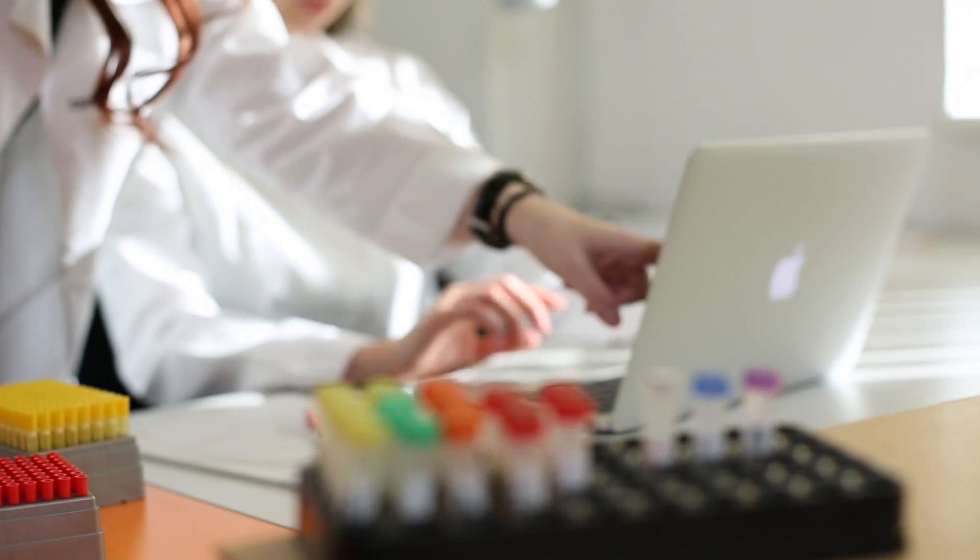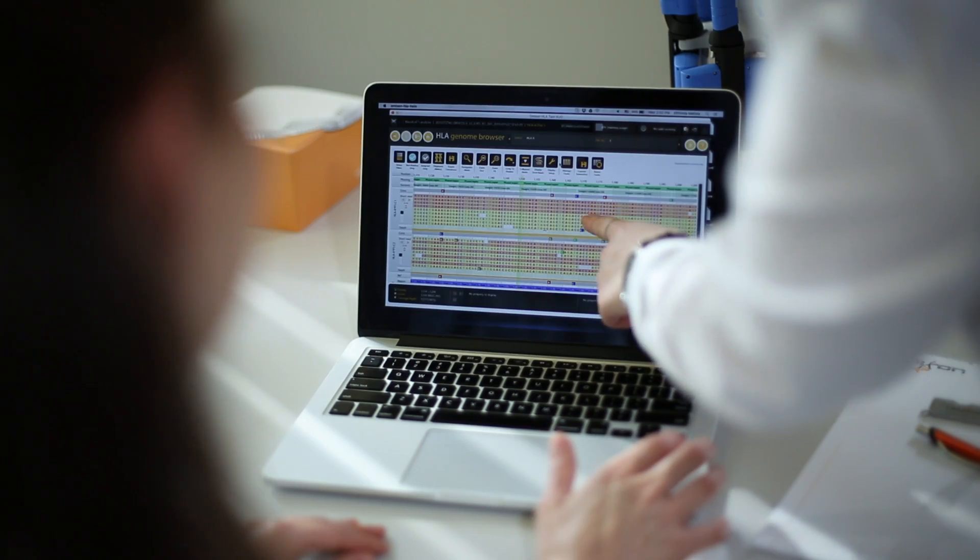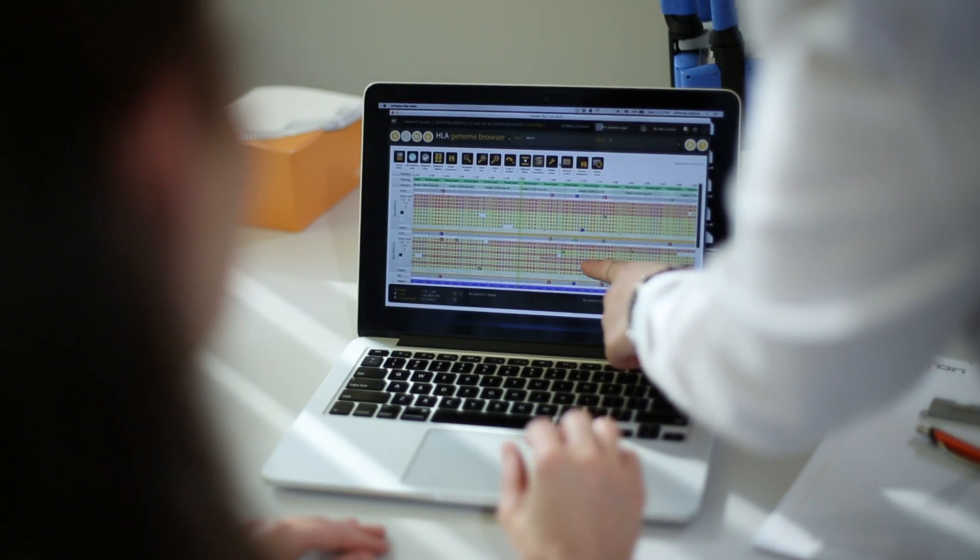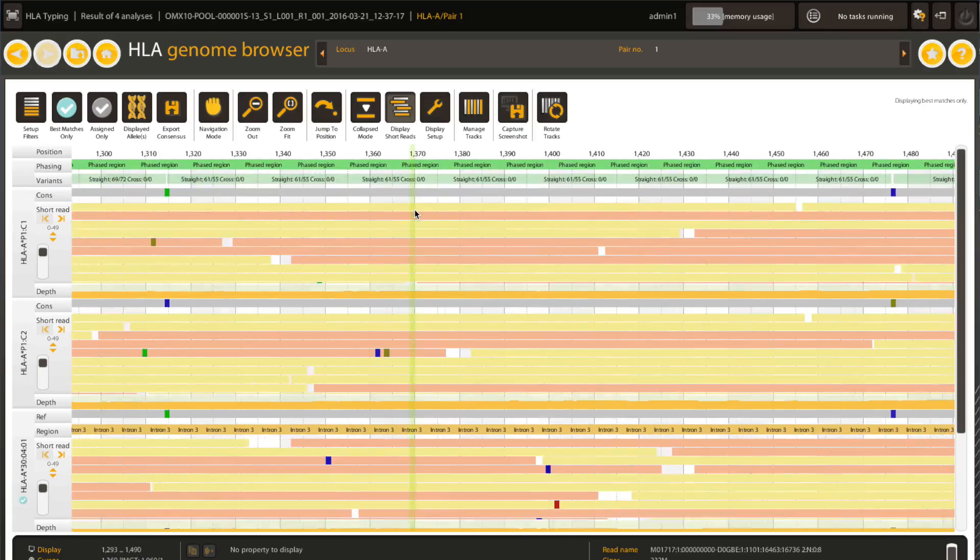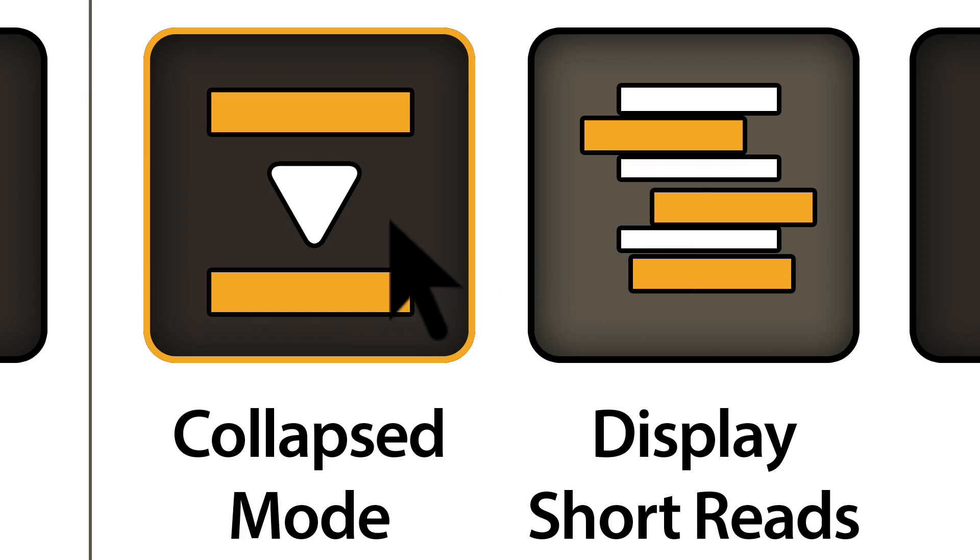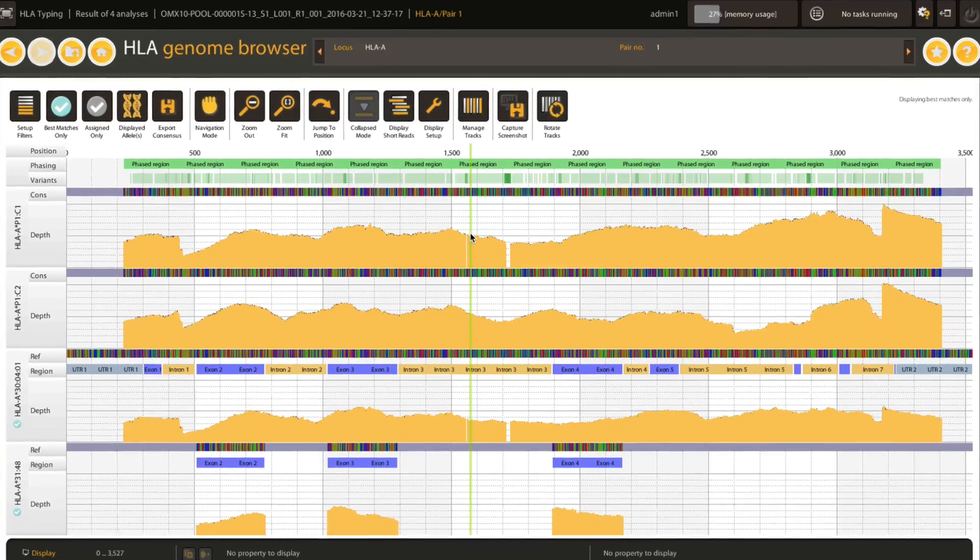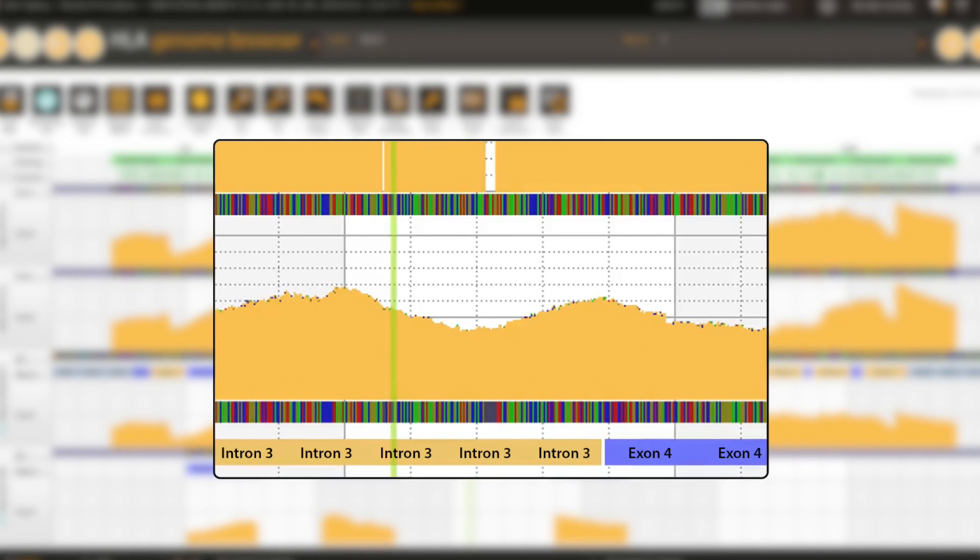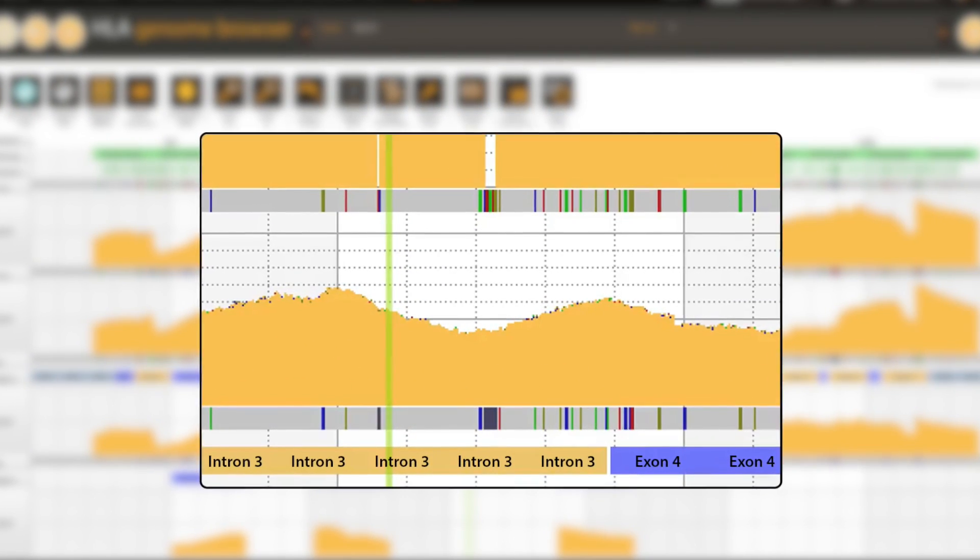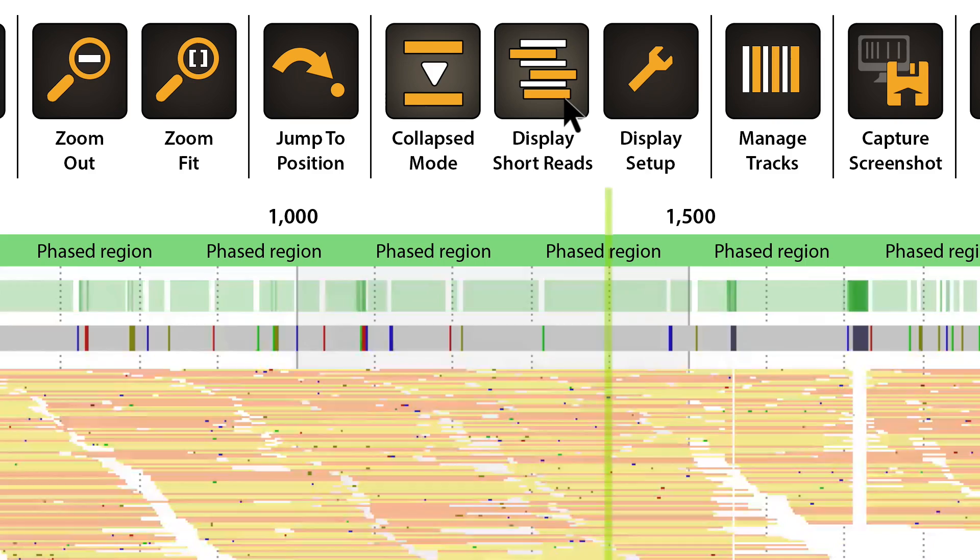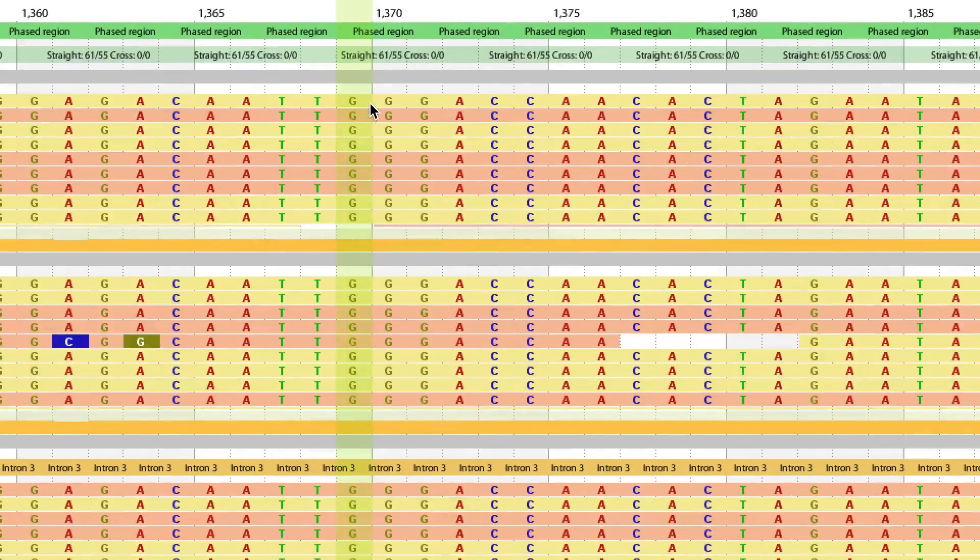Investigative work by a technician to assign the correct allele is supported by the Genome Browser, displaying whole gene consensus sequences for each locus, highlighting mismatches and novelties, and detailed information on reads supporting each position to help you make a decision.